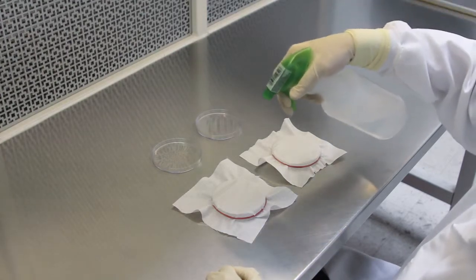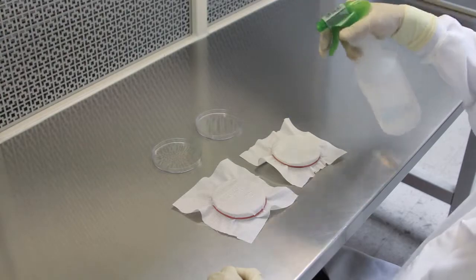Upon removing the fabric sample, the technician sees several bacterial colonies growing on the agar. Now let's take a look at some of the things that are wrong with this test method.